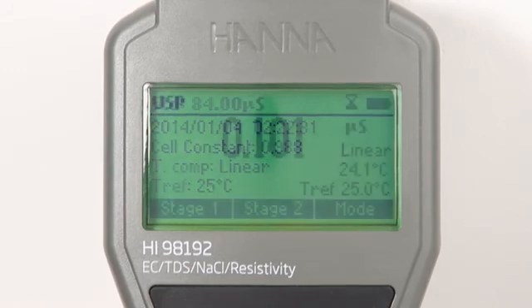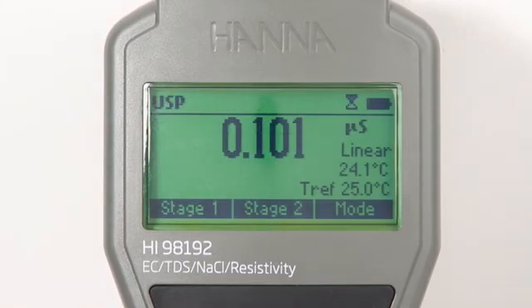The HI-98192 meter is USP645 compliant, making it ideal to check the purity of water used in pharmaceutical production. A report is generated when any of the three stages for water quality is met.